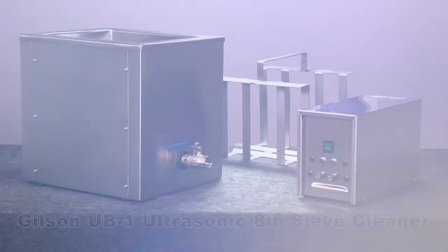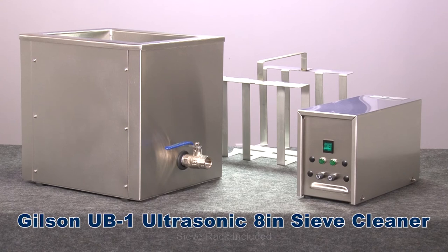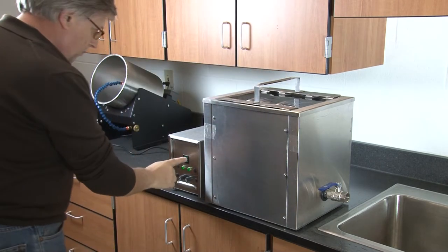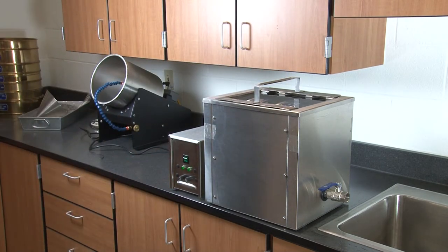The Gilson Ultrasonic 8-inch SIP Cleaner is a continuous-duty, industrial-grade, tabletop ultrasonic cleaning system designed for heavy-duty daily use in any busy materials testing lab.